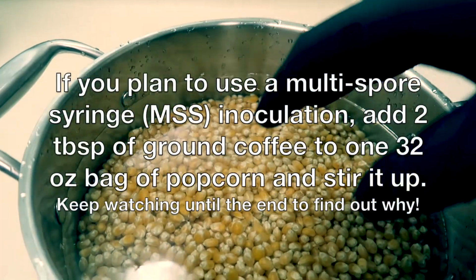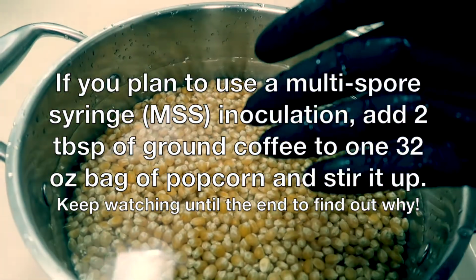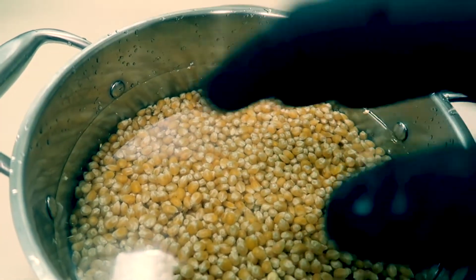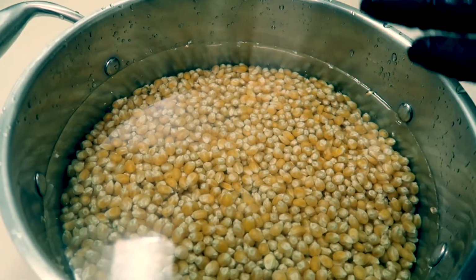And this is the step where you might see a lot of people add some coffee grounds, add some gypsum, add any other type of nutrition, sugar. We're going to keep it as simple as possible and just leave it as it is. This is going to be bare popcorn, cooked and sterilized, prepared perfectly just for your own mushroom grain spawn.